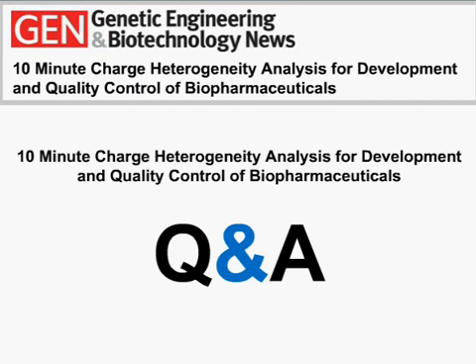Thank you very much, John. Actually, we have extensive verification and validation data on the new coating type for the HT cartridge. We guarantee at least 100 runs on the HT cartridge. With that said, one thing that must be taken into consideration, since it is a hydrophilic coating, is that having the capillary stored with catholyte can damage that coating. So we stipulate that you should minimize exposure of that capillary to the catholyte, idle without the system running, to less than 4 hours. Hopefully that answers that question.